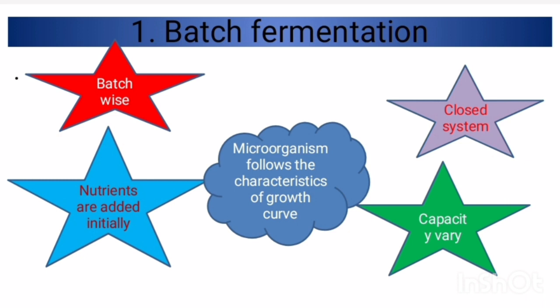It may be necessary to add acid, alkali, or antifoam agents. We can add acid or alkali or antifoam agents during the processing time. But there is no addition of nutrient media or microbial culture.